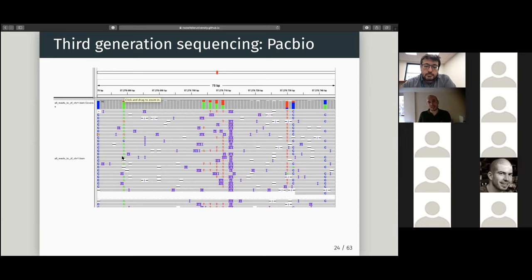So here, actually, I think the errors were masked out. But you can tell, for instance, that there are two errors in the reads where there are two Gs, and all the rest is A. So the reference is, I believe, T, then you have A's, and then a bunch of errors, the C and two G's in there. And that's what you're actually looking for, right? All the other stuff is not interesting, but that's what you would like to do when you're calling variants from a sample.